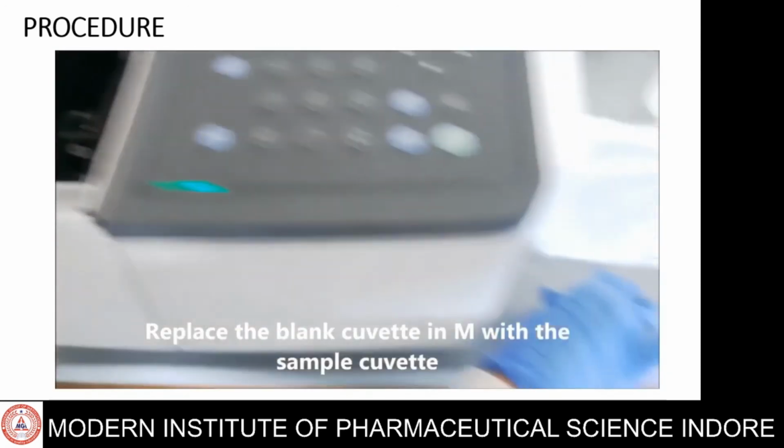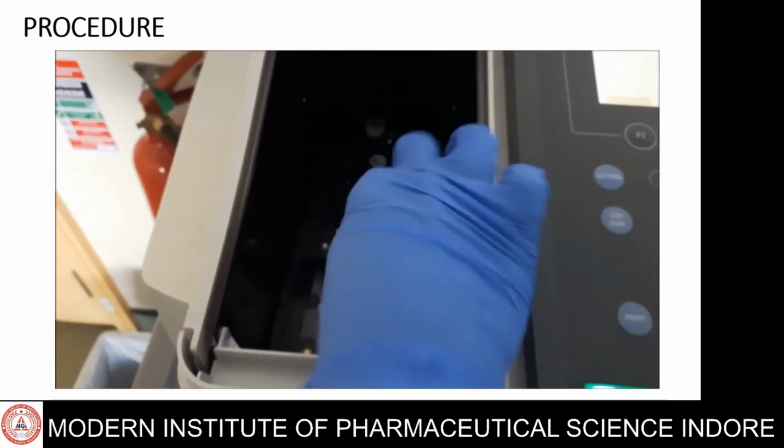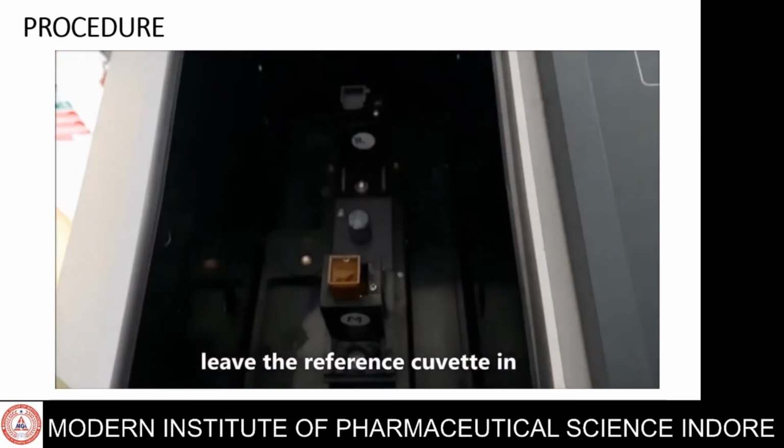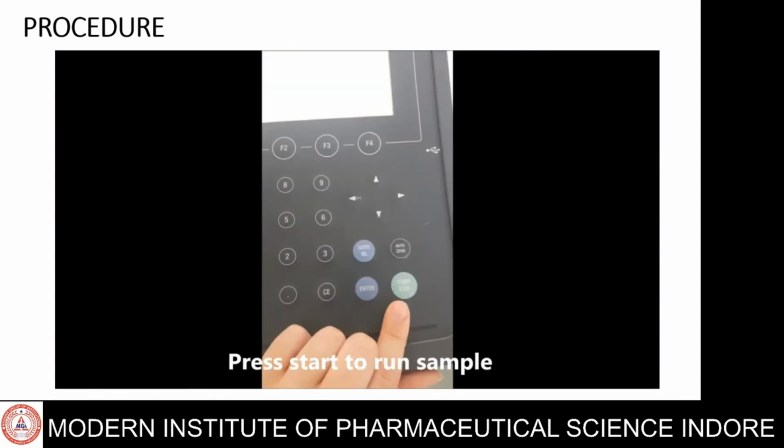Replace the blank cuvette in the sample slot with the sample cuvette. Leave the reference cuvette in. Press start to run the sample after baseline correction.